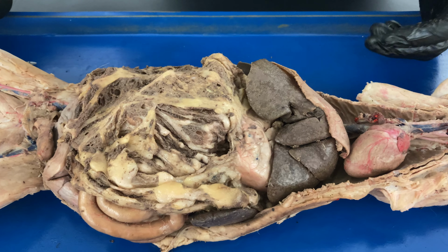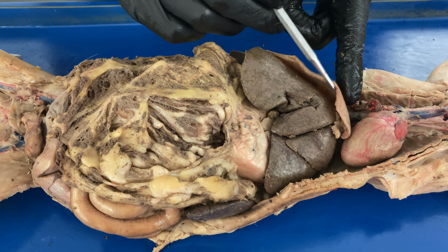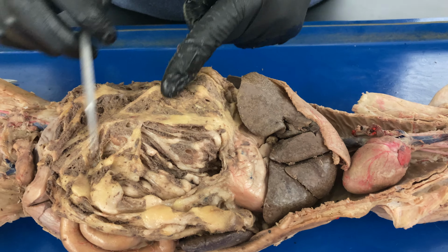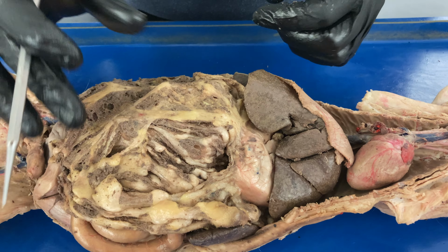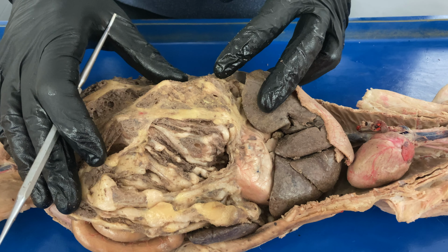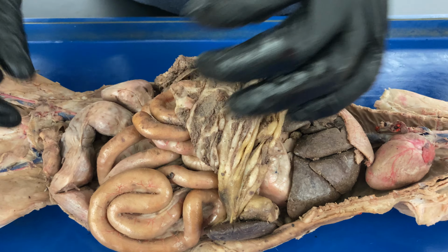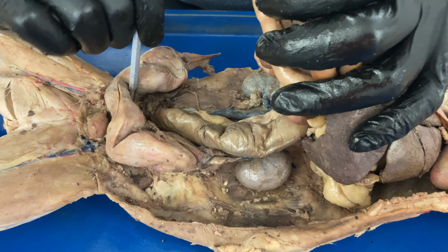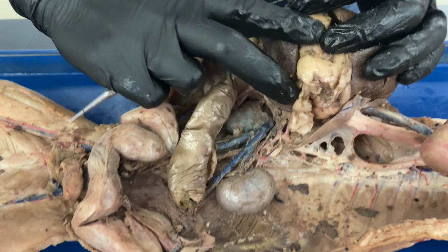Okay guys, so this is going to be the blood vessels below the diaphragm. So here's our reference, here's our diaphragm, separating the thoracic cavity from the abdominal cavity. What we want to look at now is that all the organs are still attached or intact in the abdominal cavity. Here's our greater omentum. What I've done is I have cut the large intestines right down here where it enters into the anal canal, and I'm just going to flip the organs back.